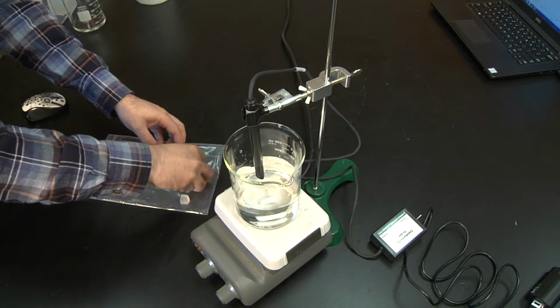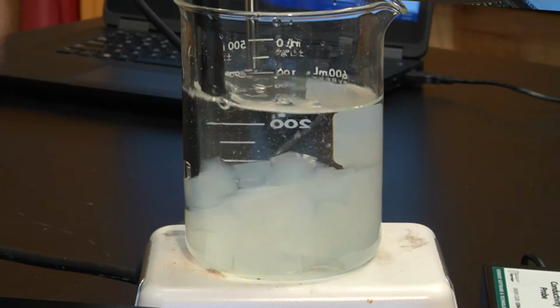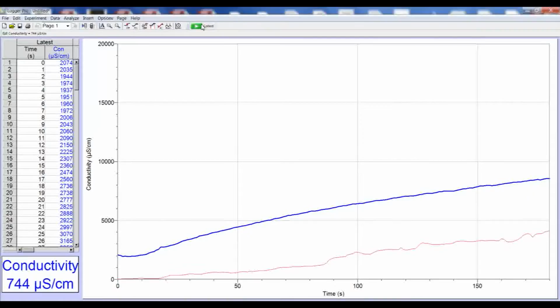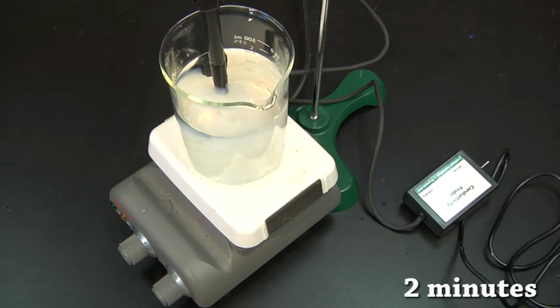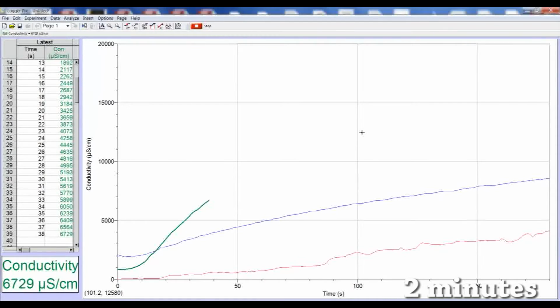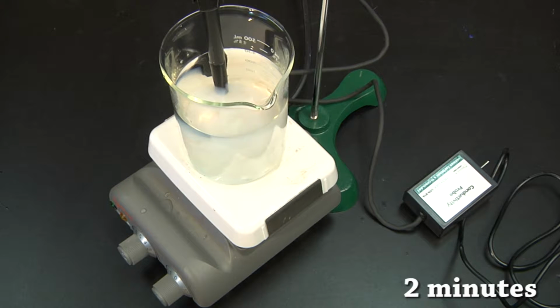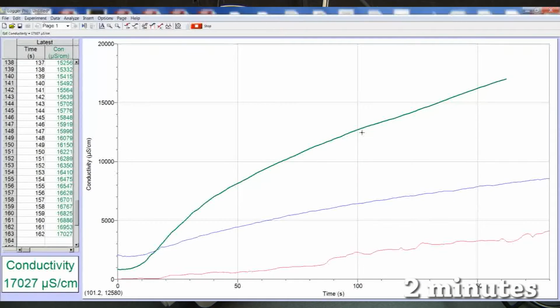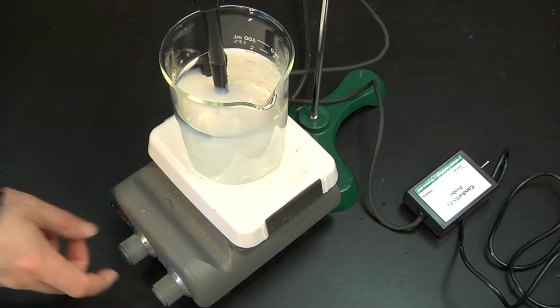After I add my cells, I will start data collection. It will ask me if I want to store the latest runs. I will click yes, I store. Now data collection is complete. It's time for cleanup.